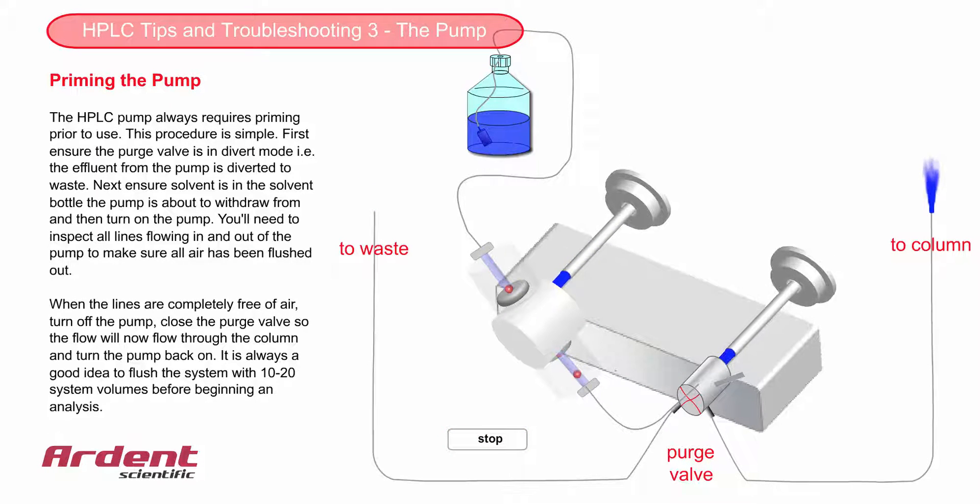HPLC pumps will have a soft start-up function, so the pump gradually increases the flow to the required set point. The back pressure will also slowly build up to a maximum pressure.